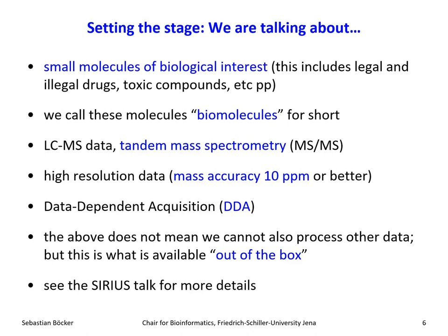So now the usual setting the stage slide. I already talked about that a lot in the Sirius and ZODIAC talk. So if you want to know more details, please have a look there. But very quickly going through it, we are talking about small molecules of biological interest, including a lot of other stuff, drugs, toxic compounds, and so on, which I will shortly refer to as biomolecules.